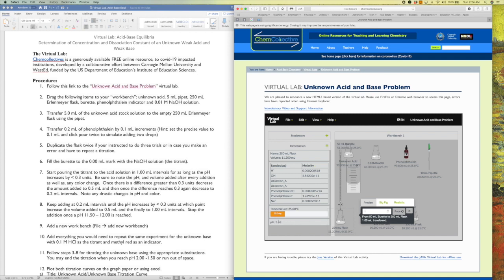So now here the increment was a little bit above 0.3. And for the beginning, and only the beginning, that will be okay. Because right now what you'll see is as I keep adding, the increments will go down, right? So I'm going to pour another 1 ml.